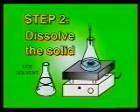When dissolving the solid, our goal is to obtain a saturated solution.